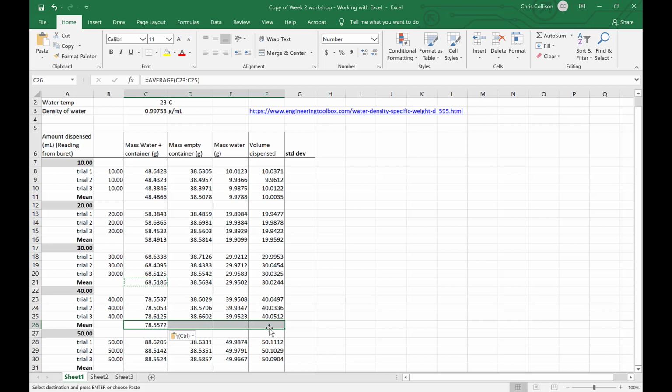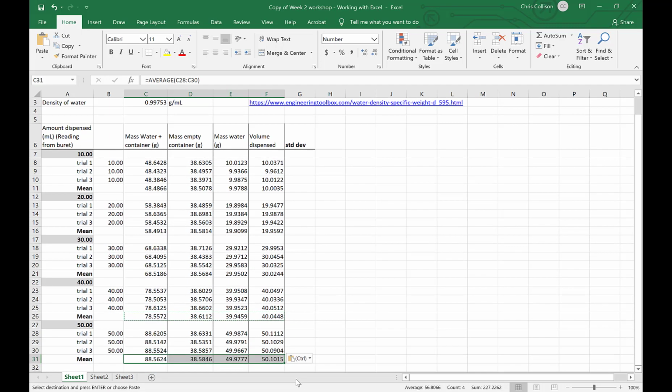It highlights all of these cells, and then I can press the fill right button. It tells me already I can use Control R as a shortcut key. Okay, so Control R, and again, in this case, Control C, I can copy all of those cells and then paste them down here. What I want to do, of course, is always make sure that everything's been pasted appropriately. Whenever errors show up in Excel, you can bet that it's usually because something's been copied incorrectly or a cell has not been locked. So we're in pretty good shape right now.